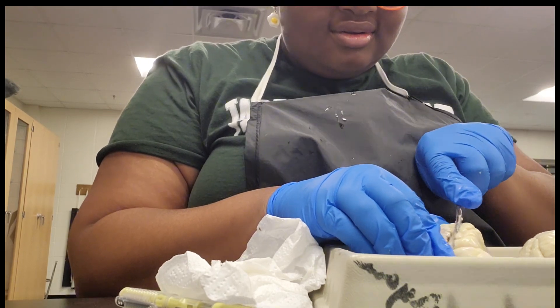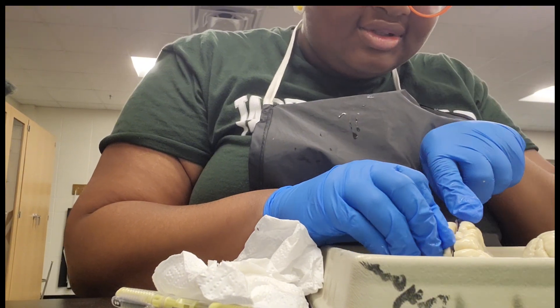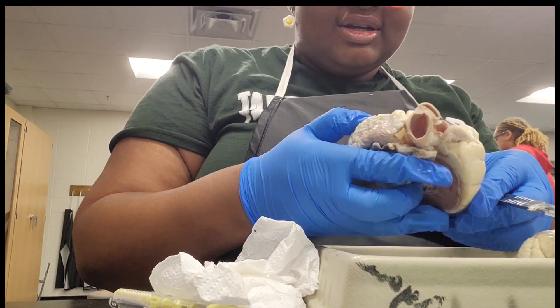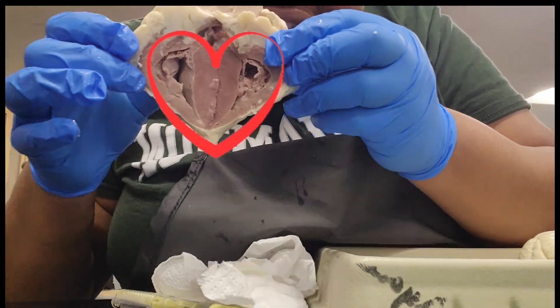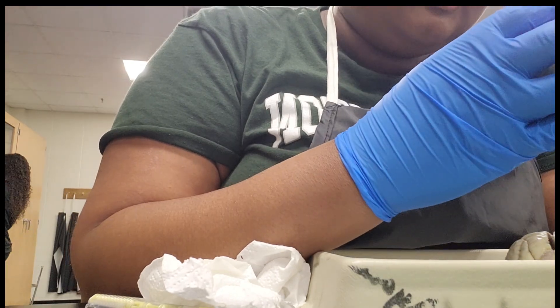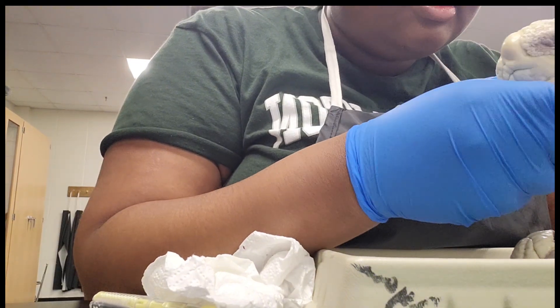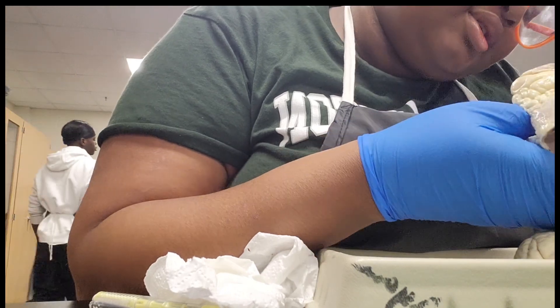Then I proceeded to dig into another half of the heart to see where the other cavity goes. Now I can see it better — there's actually more stuff in here. I was also able to get a better view of the ventricles and the atria. As you can see, I was really enjoying my time digging into the heart. Isn't the body amazing?